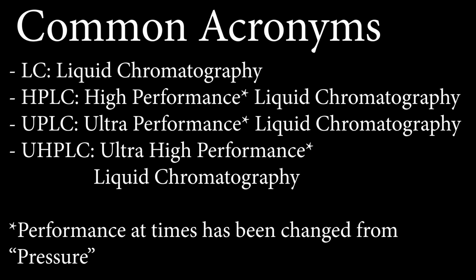The most common acronym for liquid chromatography in modern experiments is HPLC, which stands for High Performance Liquid Chromatography. You will also see UPLC, Ultra Performance Liquid Chromatography, and UHPLC, Ultra High Performance Liquid Chromatography.